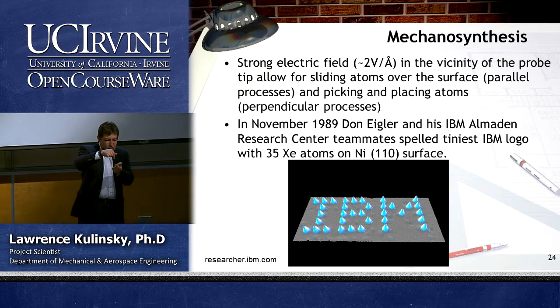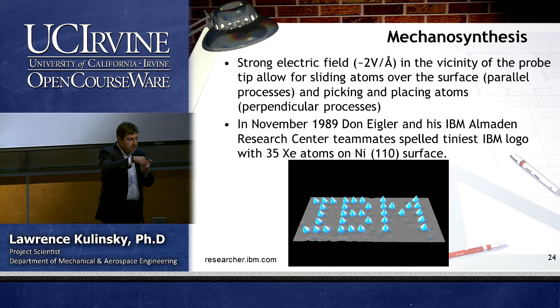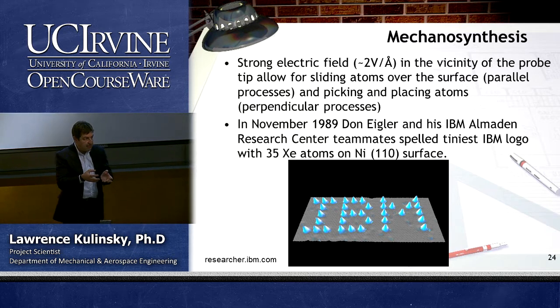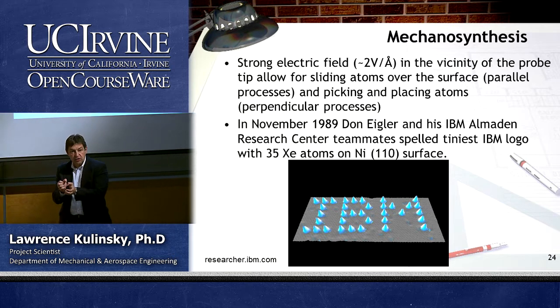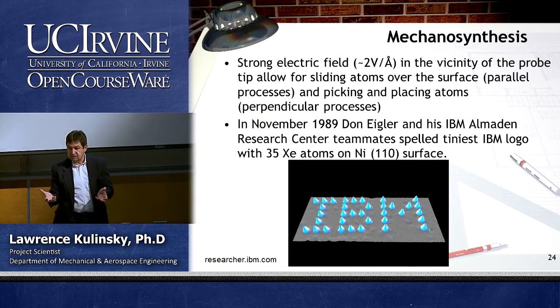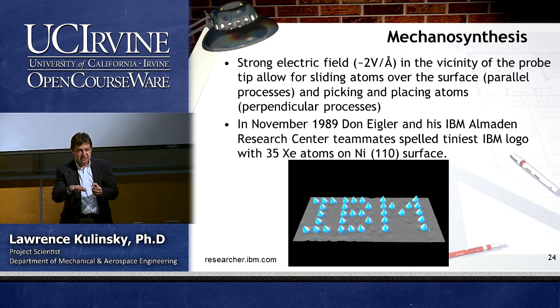It means that the adhesion between the tip of the microscope and the atom, this electron cloud overlap, is for a second stronger than between the atom and the surrounding atoms on the surface. So it almost looks like you're taking it a little bit off the surface, and you have lateral force and it lands next to its location. And then you do it again, and again.